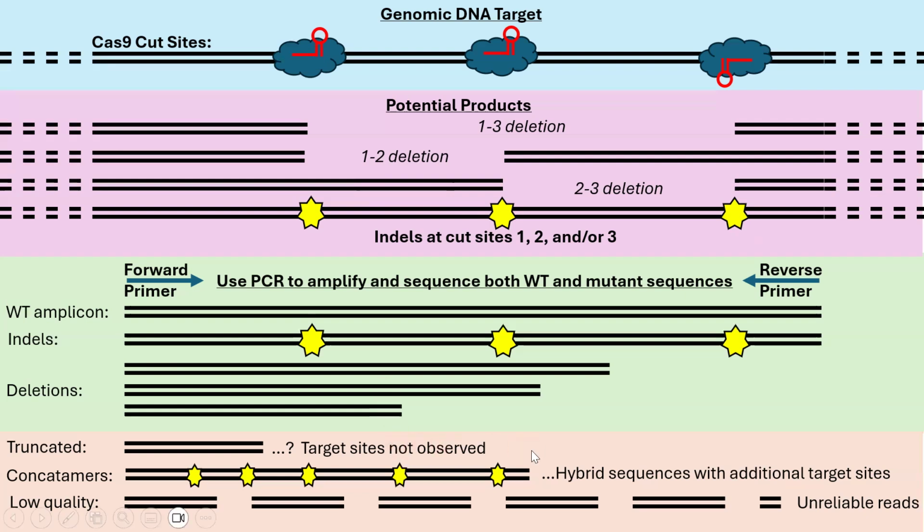We choose Nanopore here because most of the commercial services for amplicon sequencing use Illumina, and they require multiple days or a week to return data, and they're relatively pricey. So I think GeneWiz's AmpliconEZ service is around $80 now per sample. Whereas with nanopore sequencing, we can get those results back next day.